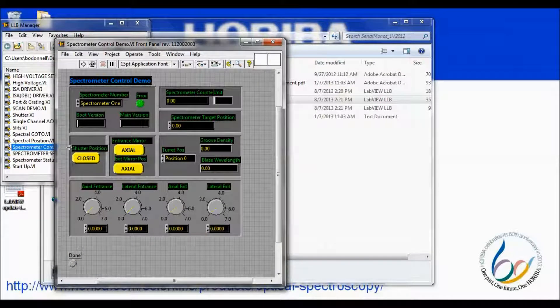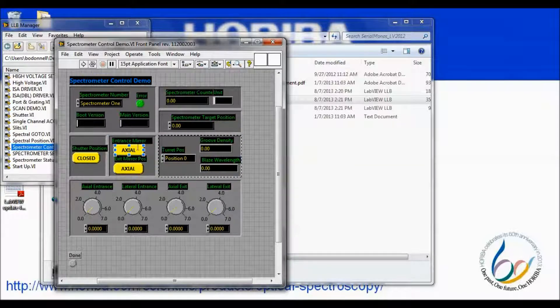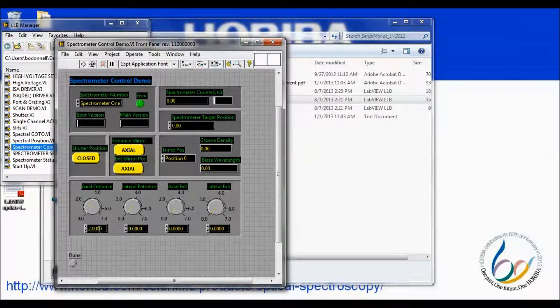Finally, the spectrometer may then be initialized by running the startup VI, and the example code may be run. Here we see the same controls that were in the USB spectrometer demo. You may set the wavelength, turret position, mirror position, and slit widths using either the knob or typing in the numerical boxes. Executing the VI will move all of the motors to their corresponding proper positions.